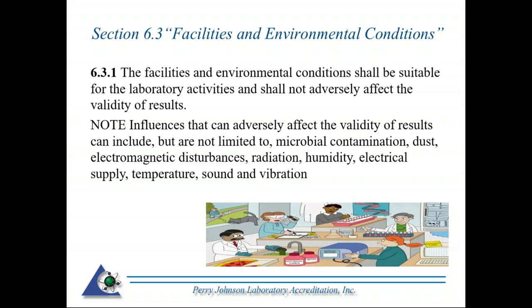There's a note within the standard here. A note, FYI, for those of you that are not familiar with what they are, they're not requirements. They're just additional information that goes along with the standard. Some things that could affect the validity of results can be microbiological contamination, dust, electromagnetic disturbances, radiation, humidity, electrical supply, temperature, sound, and vibration, which can all adversely affect the testing, calibration, or sampling that you're doing.